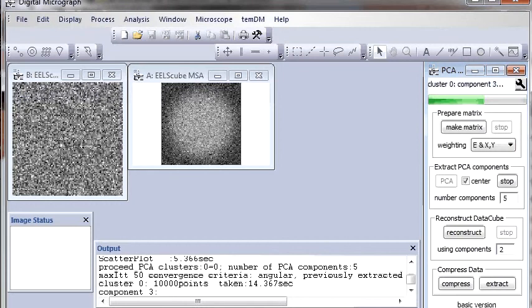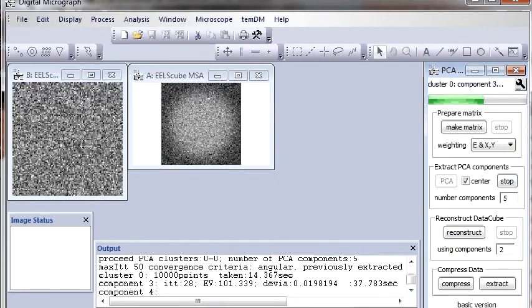In this specific simulated spectrum image, I know there are 2 meaningful components. It's a relatively simple object. In practical cases, usually we face a bigger number of components. In my practice, it's something between 5 and 10.